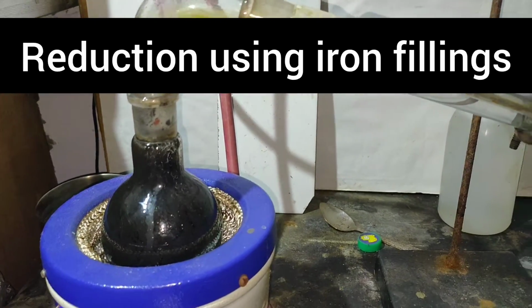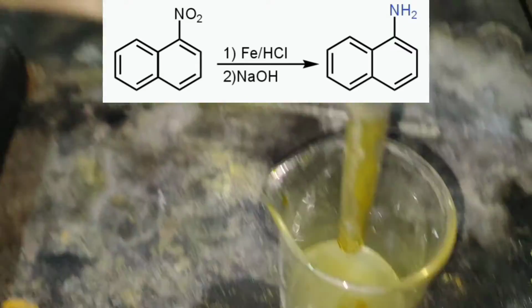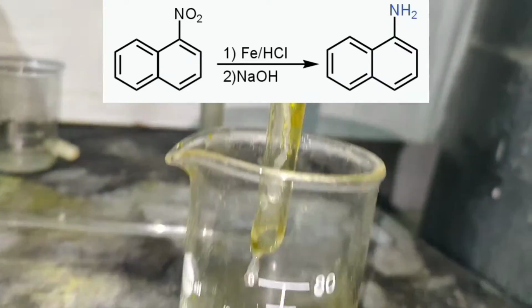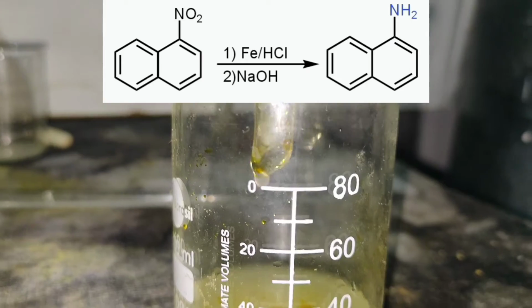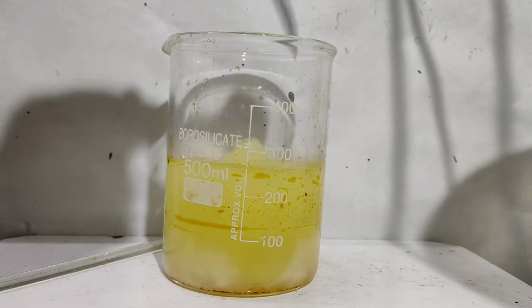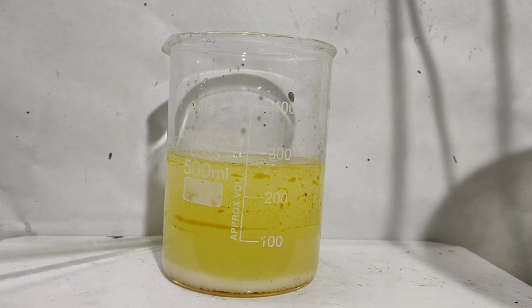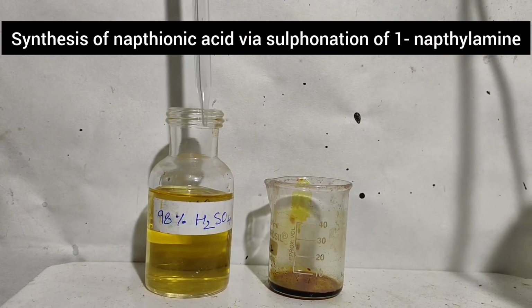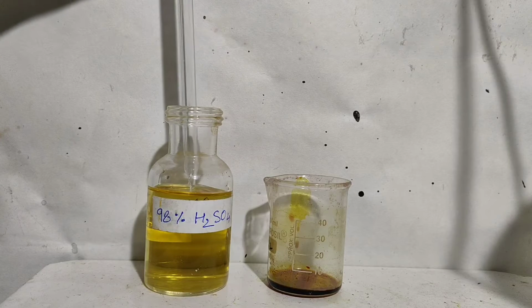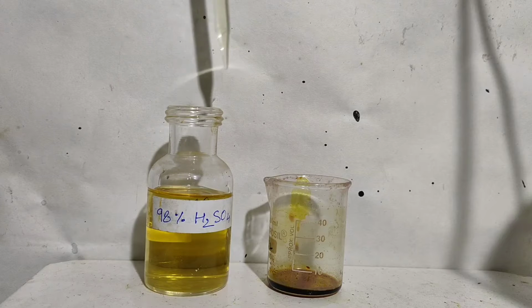So I again took 2.5 grams of alpha nitronaphthalene, and this time instead of tin I added 3.33 grams of iron filings, refluxed for 30 minutes and steam distilled, followed by salting out, again followed by solvent extraction with petroleum ether. This time, the concentrated alpha-naphthylamine was more than before, but still it wasn't solid and pure.